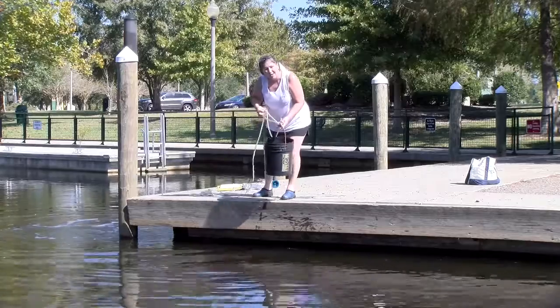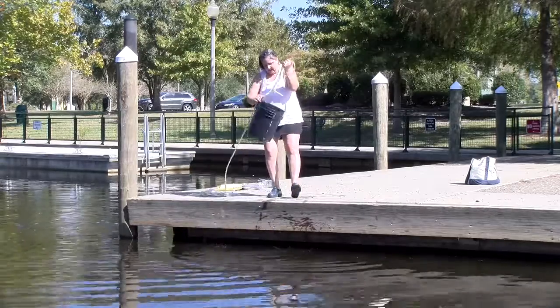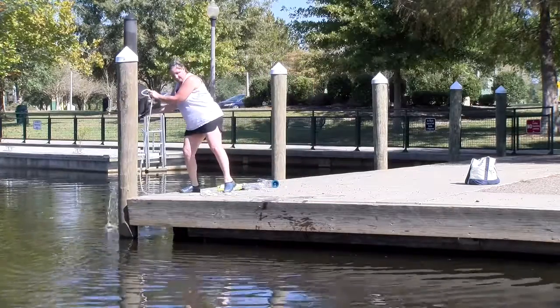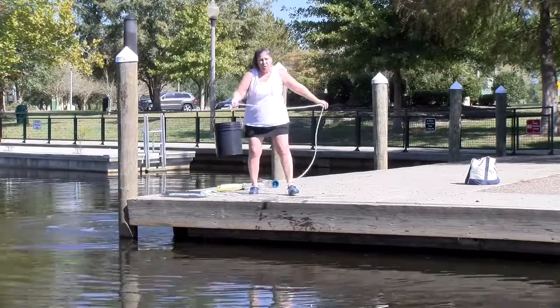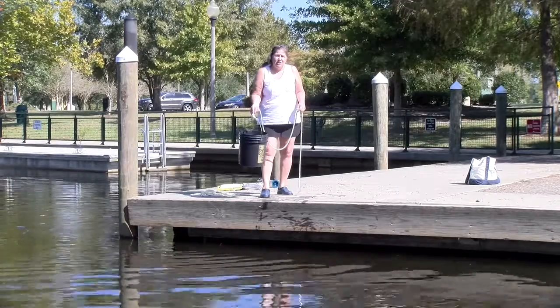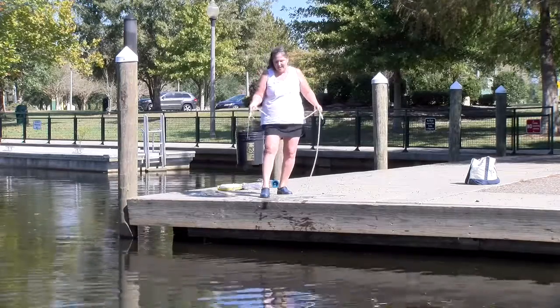So I've rinsed it once. You rinse it at least 3 times if it's really dirty. And you swish it around, you check the inside of your bucket to make sure it's clean, and you dump your sample. Now I'll take the sample for our water testing. And I'll be testing water clarity in a Secchi tube, and so I'm going to want to take at least half, maybe 3/4 of this bucket.